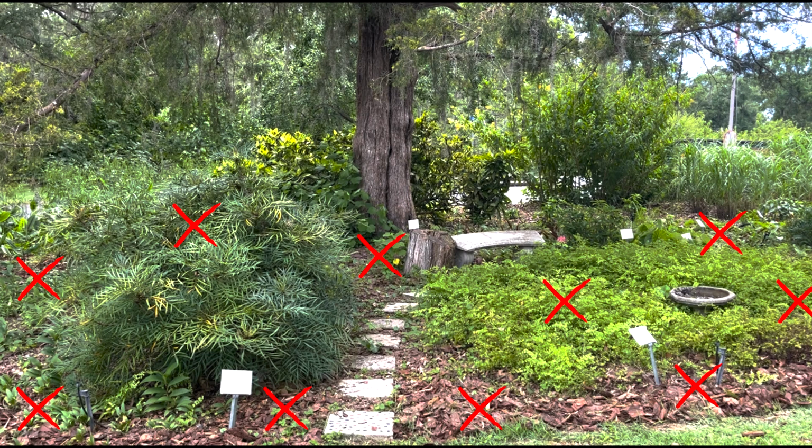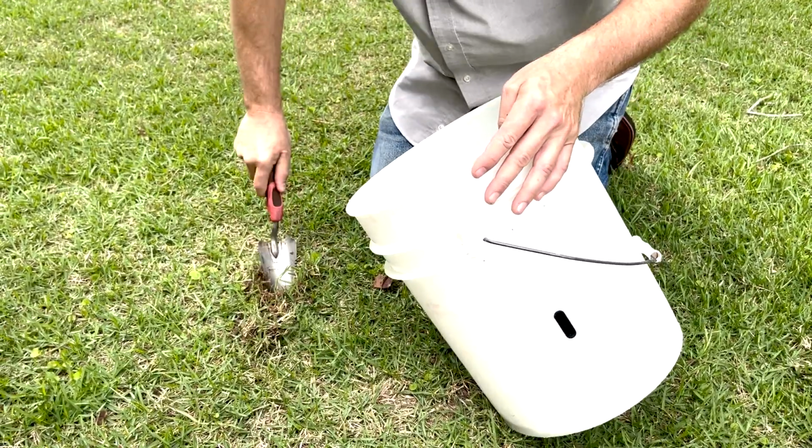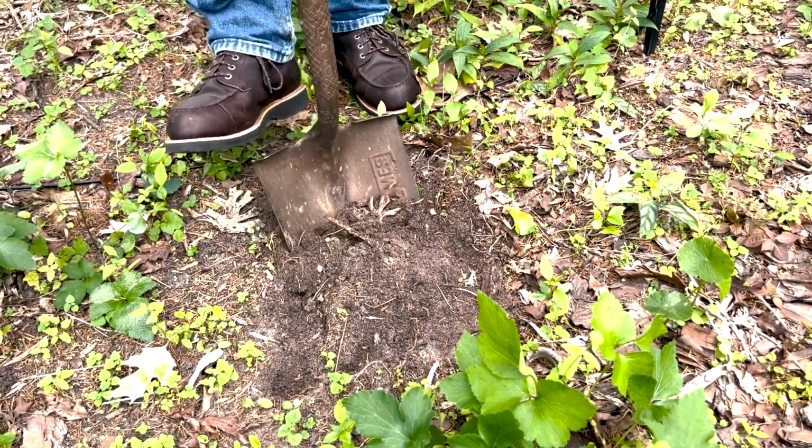You will now want to locate the area of interest and plan out 10 to 12 random areas to get samples from in your lawn or garden. This helps get as conclusive results as possible. Collect samples from the top 2 to 4 inches for lawn samples and the top 6 to 8 inches for garden samples.